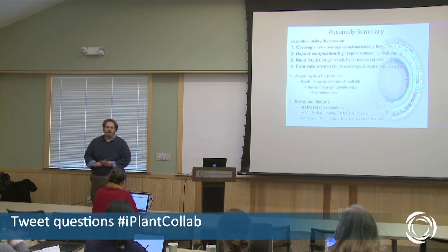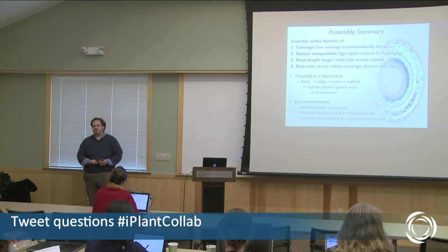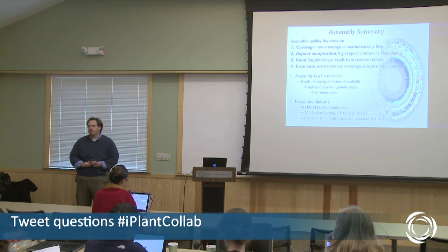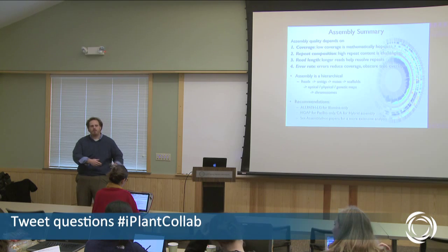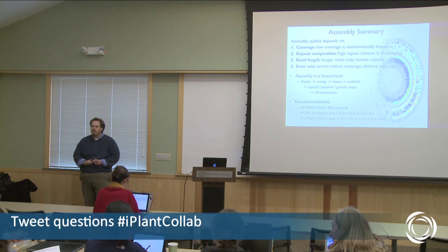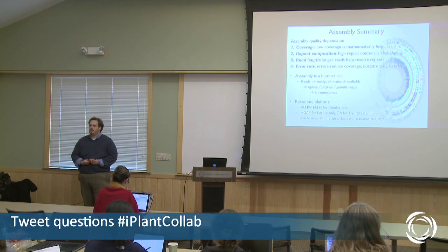As a result, I have very limited experience working with the data. I do have experience working with 454 from a few years ago, in which case I extensively used the Celera assembler. That's probably what I would start with today. You just have to be very careful to tune for the homopolymer errors that are present in the data.